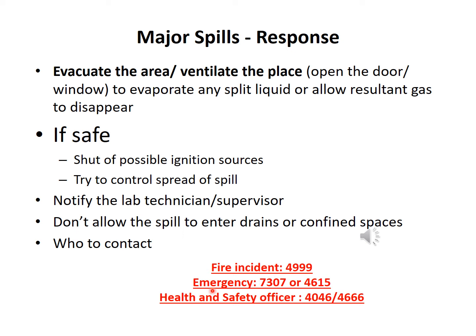the different offices, the numbers that we have at the university. Otherwise, if nobody is available, you can directly use the lab telephone and contact the fire incidents office, or emergency number, or SQUH emergency, or the health and safety officer, by yourself using a lab telephone.